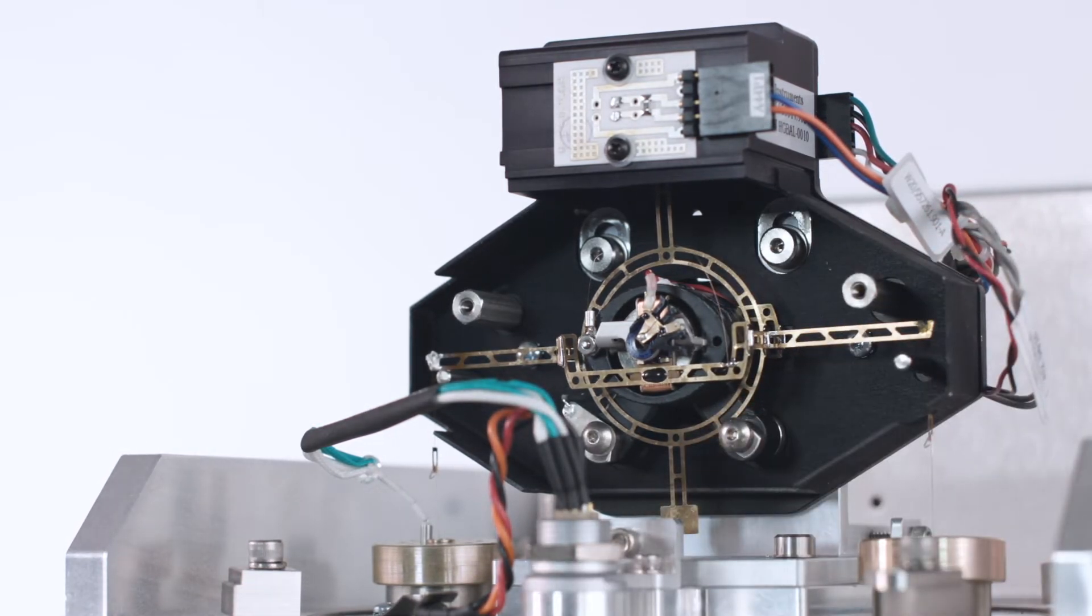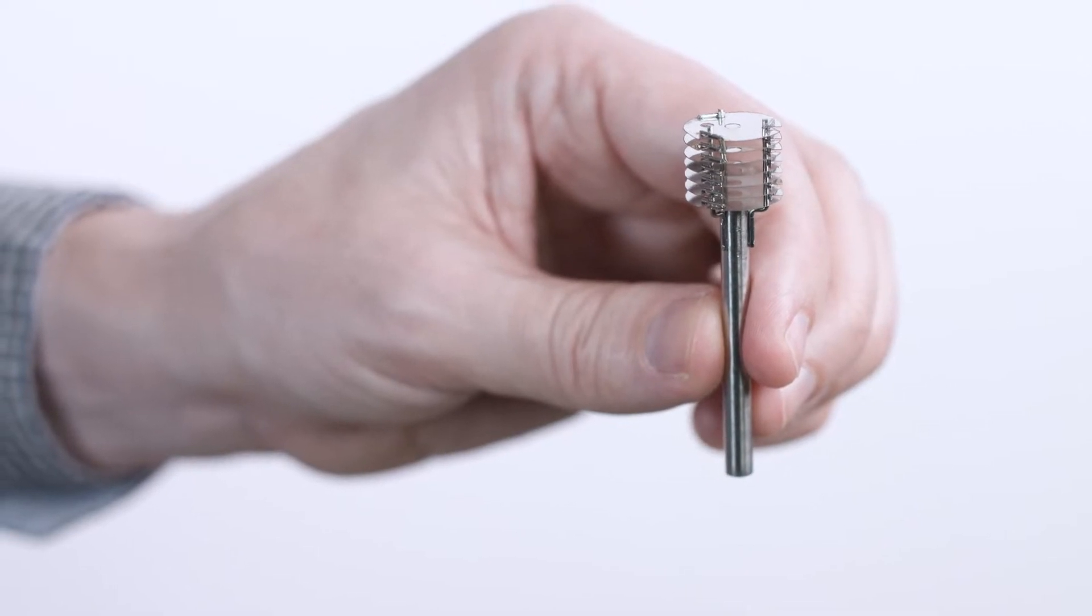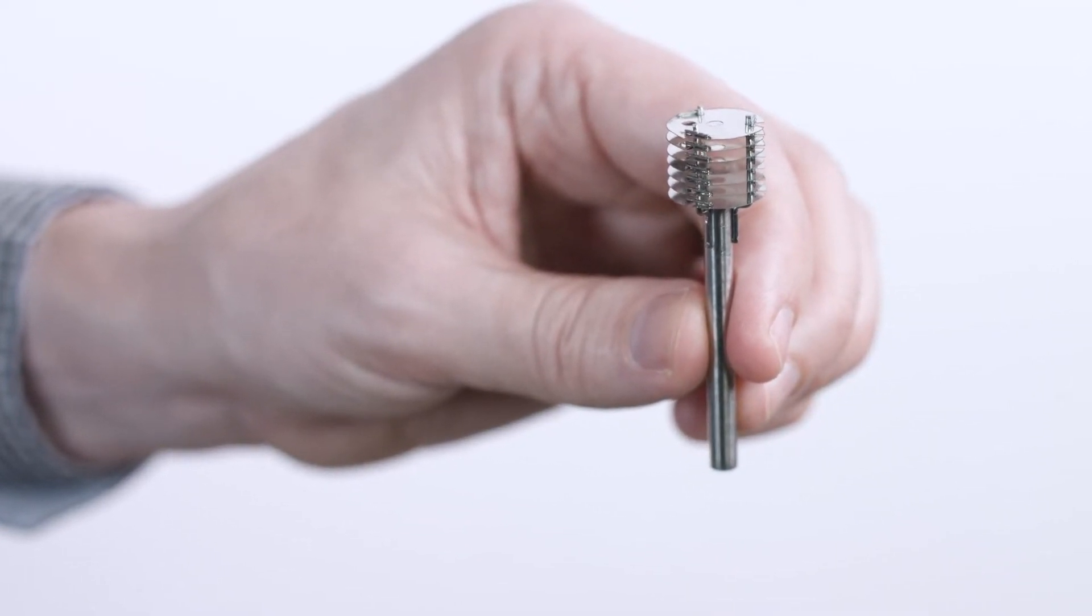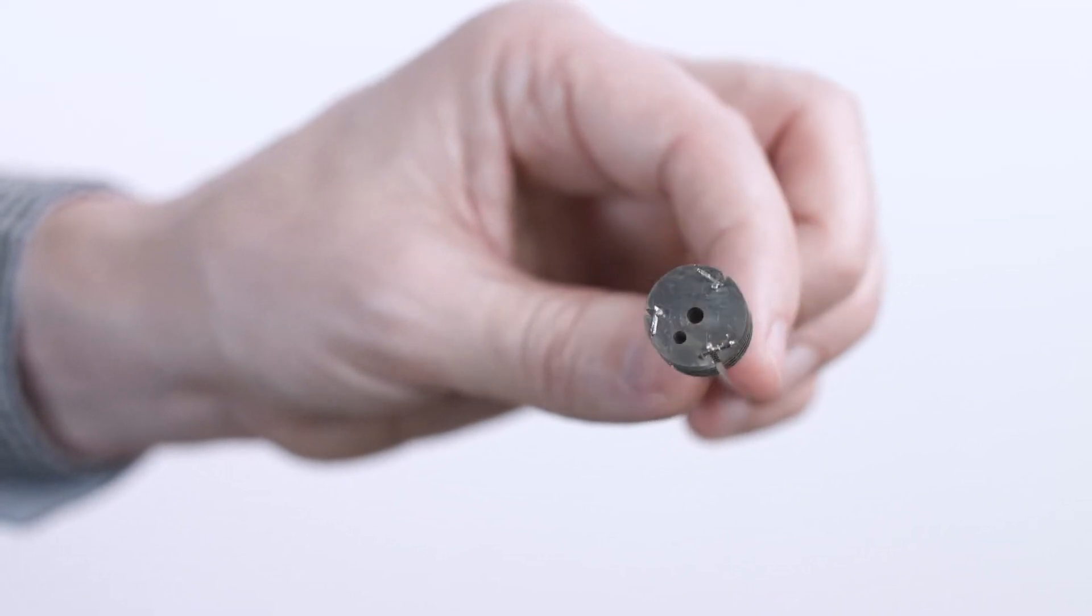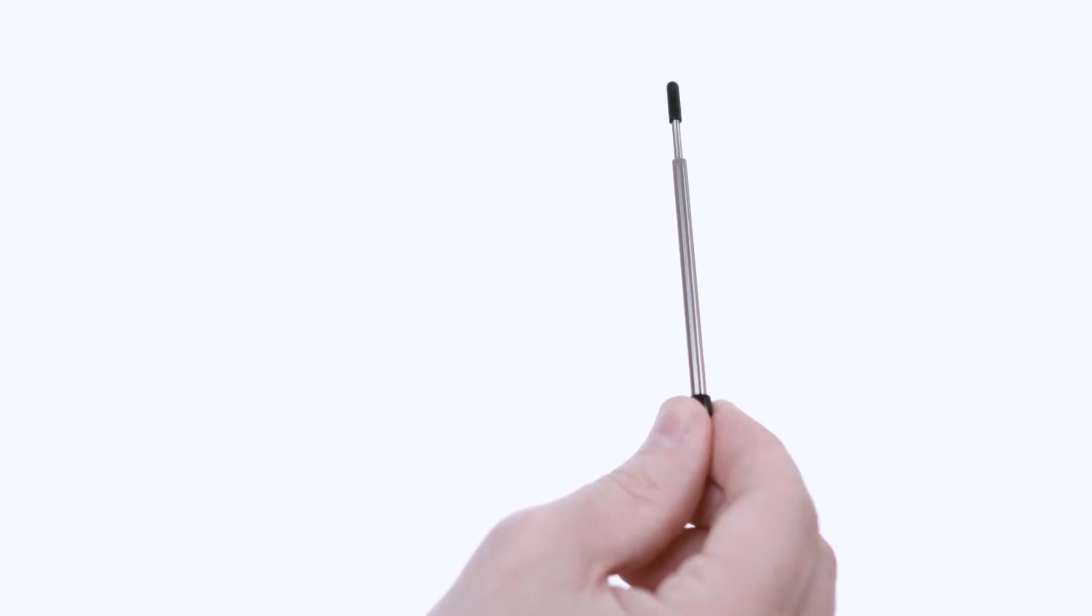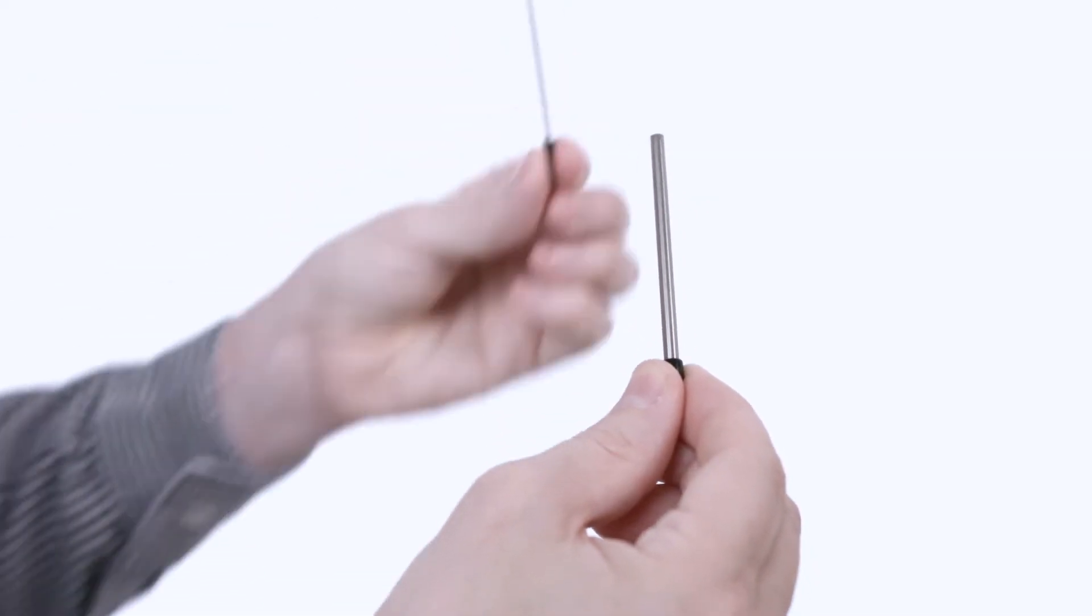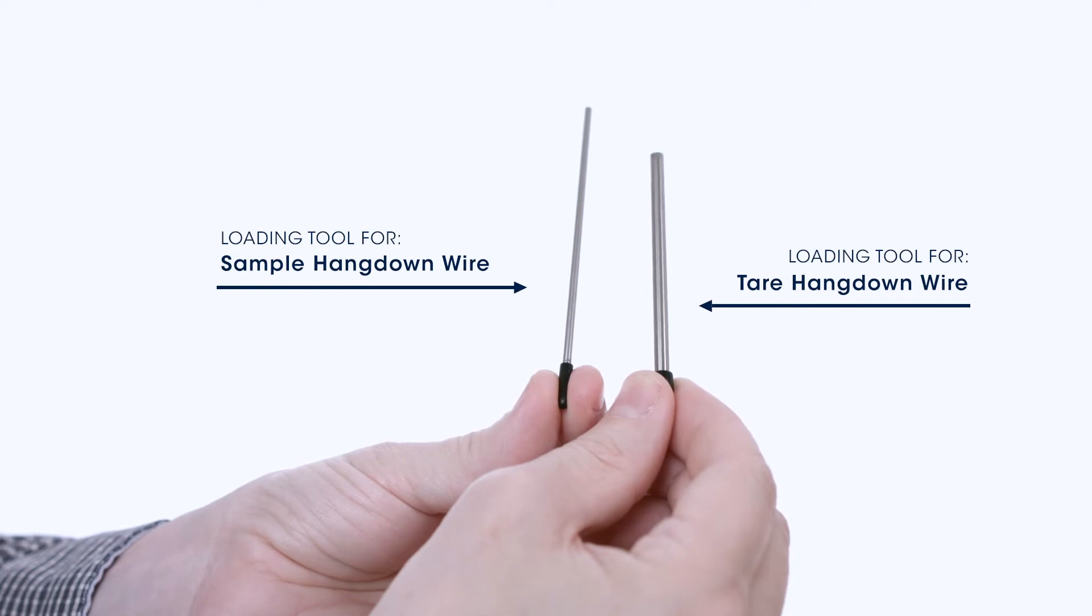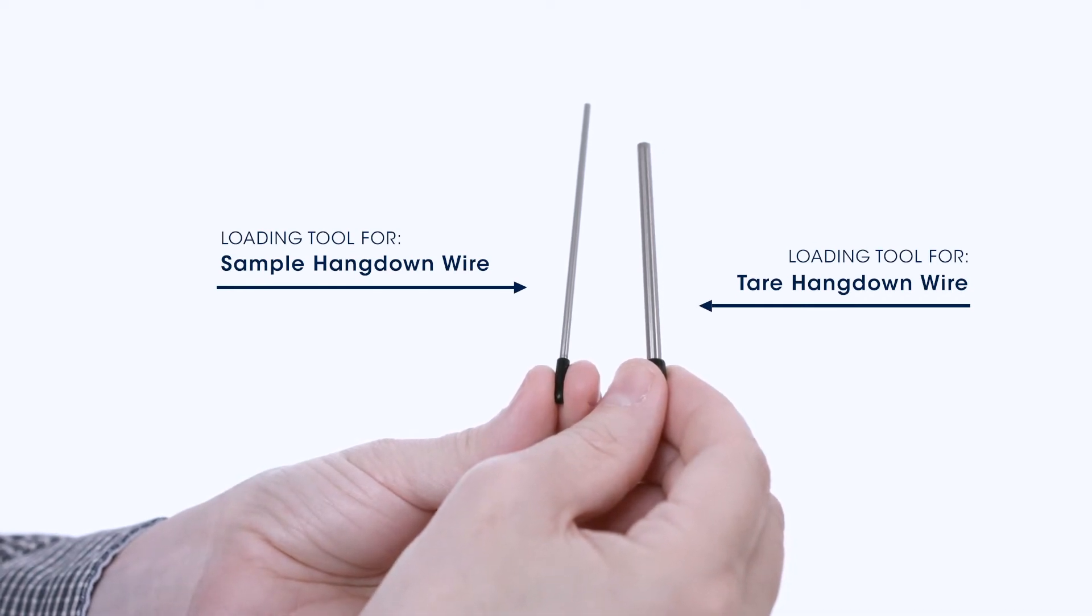The upper furnace assembly, shown here, has a hole in the center, which the tool to remove the hang down wire must be inserted through as shown in the next sequence. Select the sample loading tool from the accessory kit. Please note that the sample loading tool has a flange at one end. It may be removed prior to use, though it is not necessary.